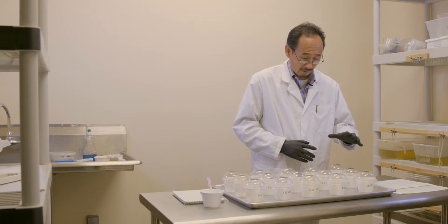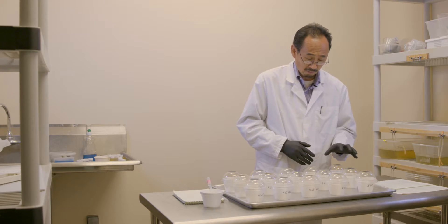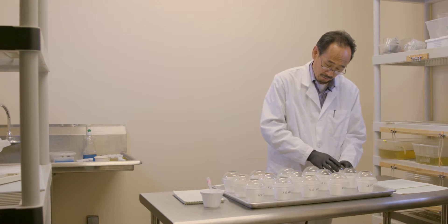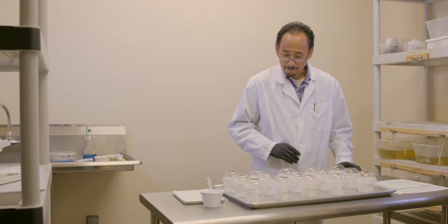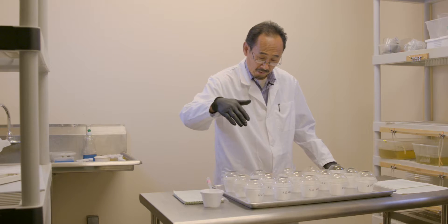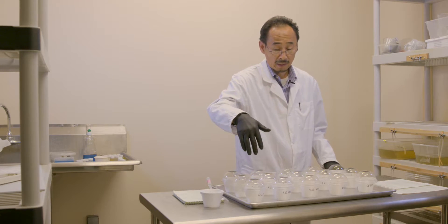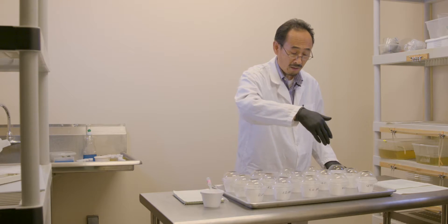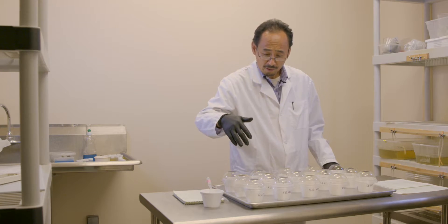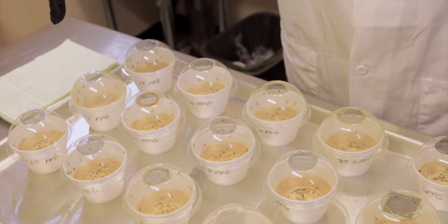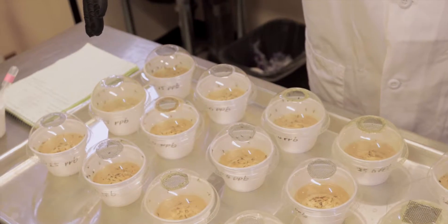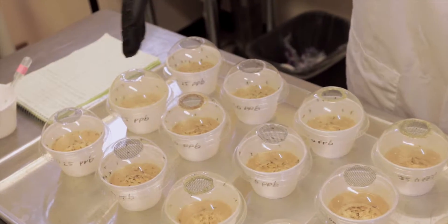A little bit scary looking, you're going to see a lot of adults buzzing inside this dome here, but be very careful, don't knock it over. You'll be sorry if you do. Then you take a quick look from the beginning, very low, and then the middle, and then the high. You should approximately see a difference of adult mosquitoes in the dome. You should see more at the lower end, less if any on the high end. You see a pattern going through this.